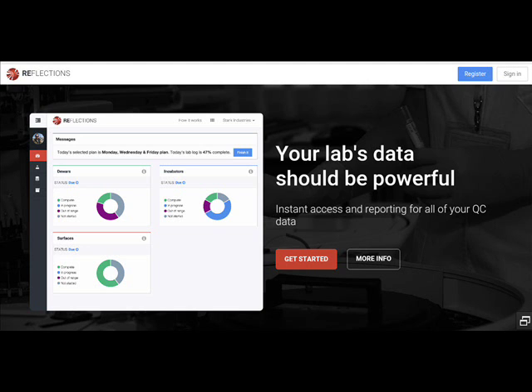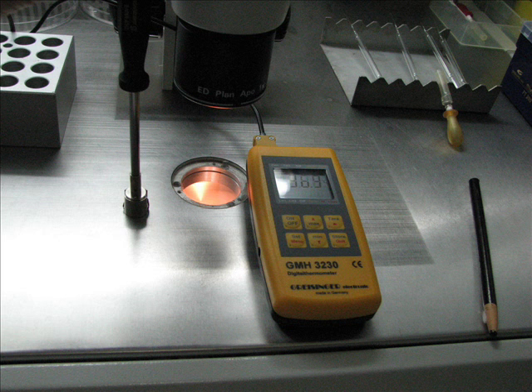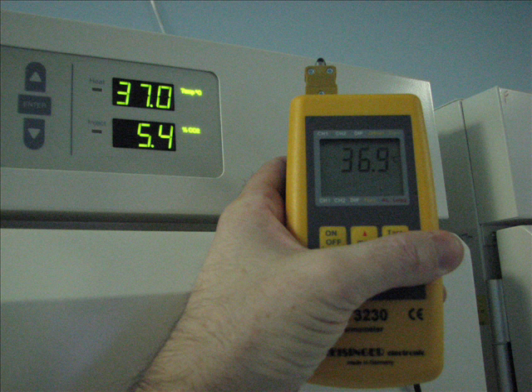To almost any lab this app can be used, and I've been using it with my tablet Samsung 10.1 and generally walking around the laboratory as I would have done before with my clipboard. Every day we have to add values for our equipment, and this is making it a lot easier. It allows us to add information which is for our own lab, and we can create a lab virtually online using it to track the equipment.